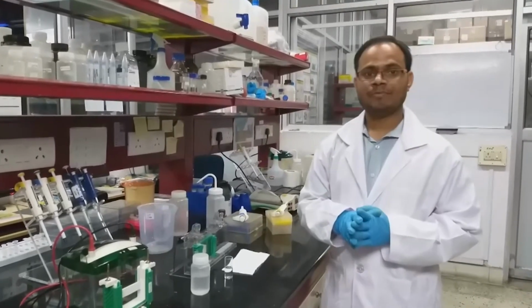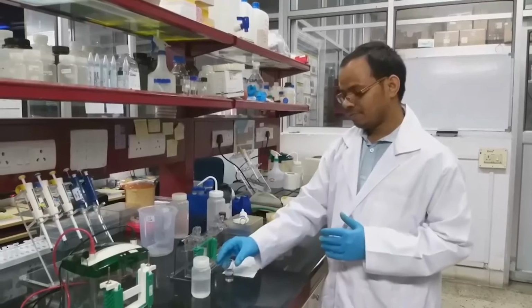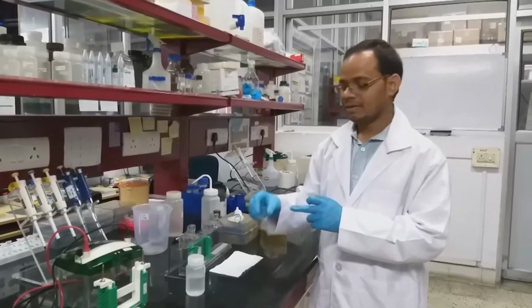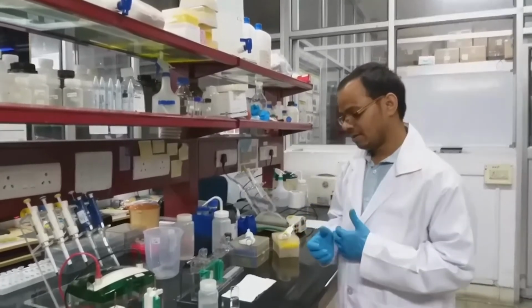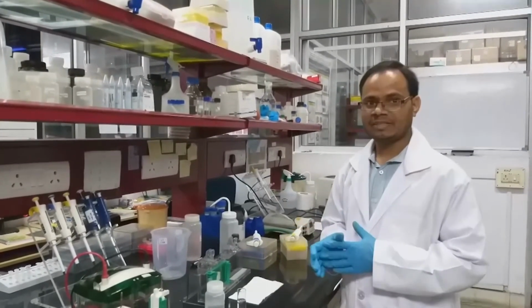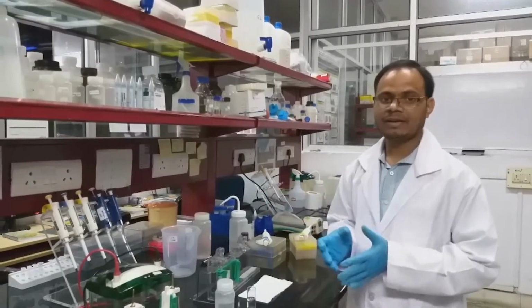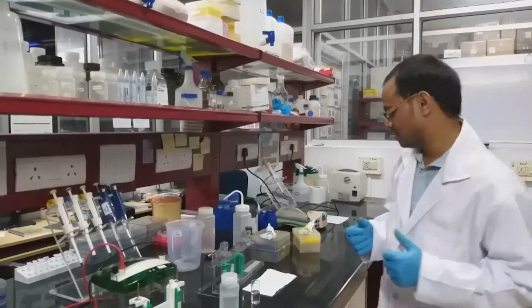In the final step, we have to add TEMED. After adding all the components, at the end, we have to add TEMED, because if you add it earlier, it will quickly facilitate the polymerization. So you cannot take it out with the pipette. It completely solidifies. So that's why you have to add it at the end of the resolving gel.